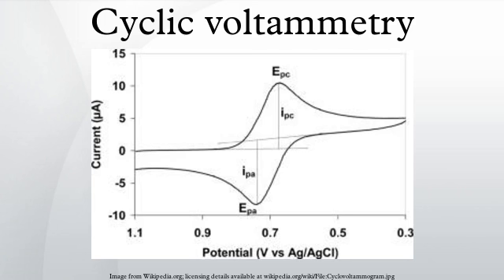Cyclic voltammetry, or CV, is a type of potentiodynamic electrochemical measurement. In a cyclic voltammetry experiment, the working electrode potential is ramped linearly versus time. Unlike in linear sweep voltammetry, after the set potential is reached in a CV experiment, the working electrode's potential is ramped in the opposite direction to return to the initial potential. These cycles of ramps in potential may be repeated as many times as desired. The current at the working electrode is plotted versus the applied voltage to give the cyclic voltammogram trace.